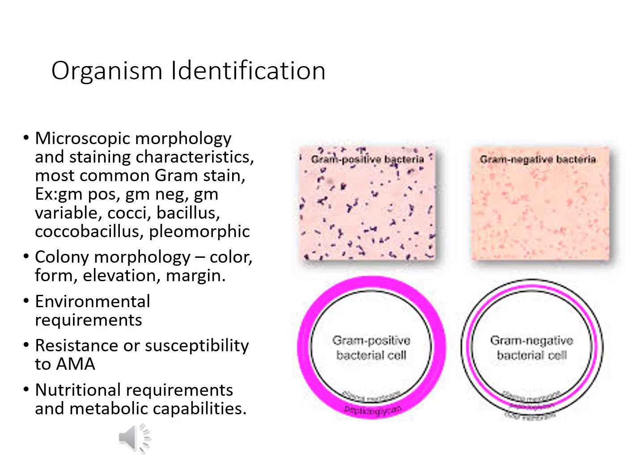So you can refer to your textbook for colony morphology. You're also going to look to see, are they small, large, spreading, domed? This is once you get it onto the plate. Do they have feet? You'll understand what I mean by feet when we talk about yeast. Do they swarm? Again, what does their outer rim look like? What does their margin look like? What color are they? You're going to ask these types of questions whenever you are looking at your plate.